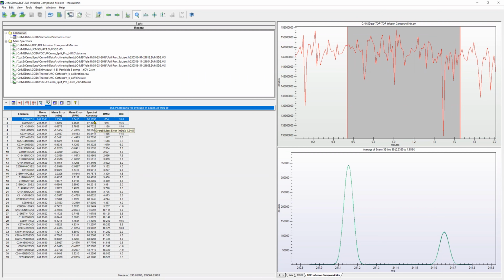Typically, high resolution instruments, believe it or not, are not quite as good in terms of linearity. You may well know this. So you'll get somewhat less spectral accuracy, but still good enough spectral accuracy to do very good formula identification. And even the second compound here is significantly different in the match. So that's a unique match. You don't always get that. Typically it'll limit from these 40 compounds on the search list.